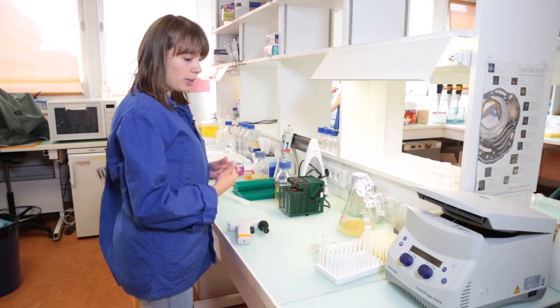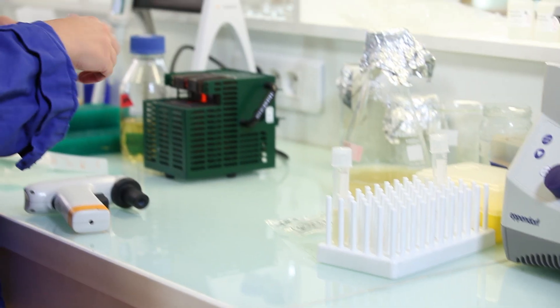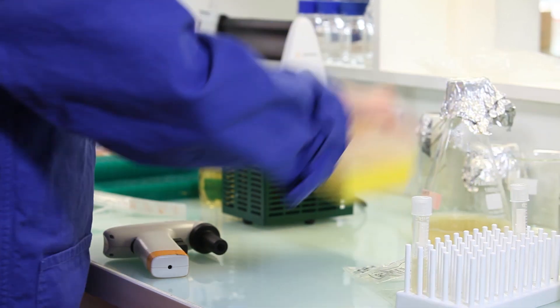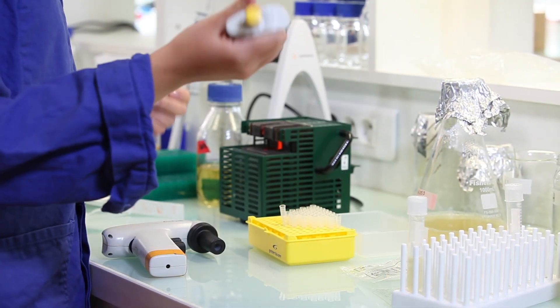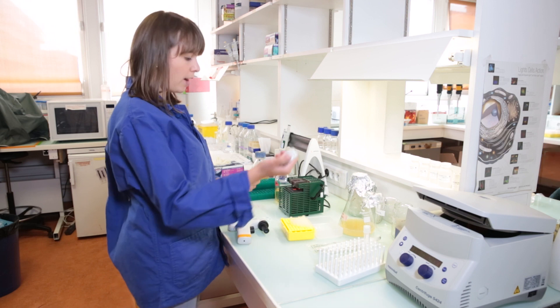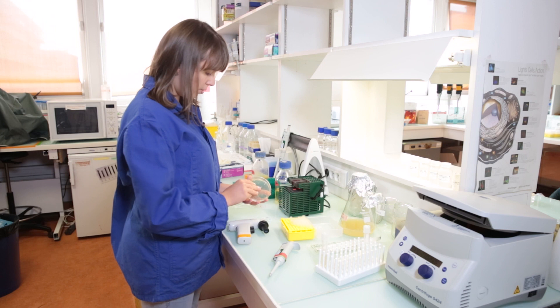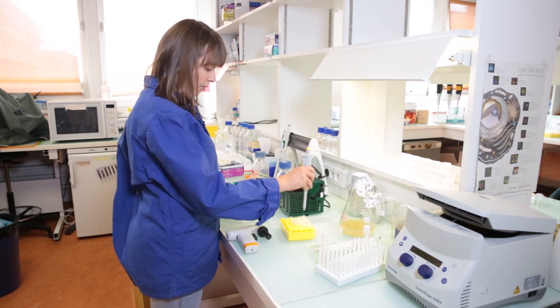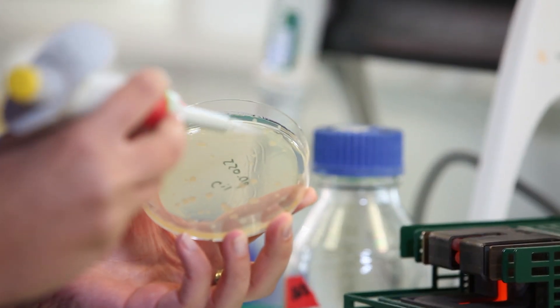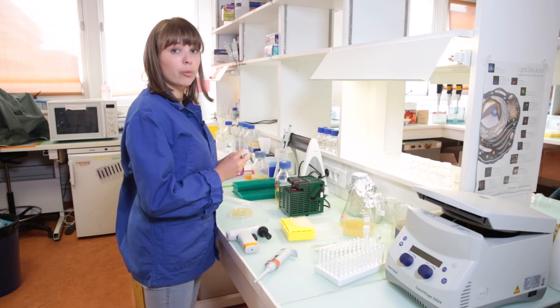We also need to add antibiotic to the media. The antibiotic is needed to prevent other contaminants from growing. This way, only our bacteria containing our plasmid will grow in this media. And now we have to pick one single colony from a plate. We are also doing this in a sterile environment.